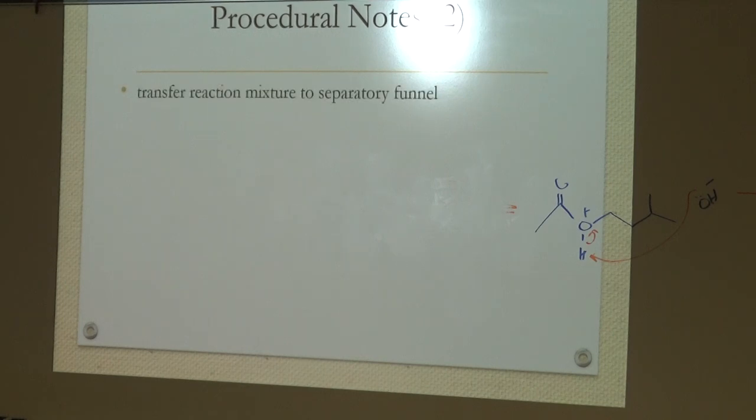The reaction then gets transferred to a separatory funnel. Add water. That's going to take away all that acid that might be around. And it should also help get rid of any unused acetic acid reagent and or some of the isopentyl alcohol.